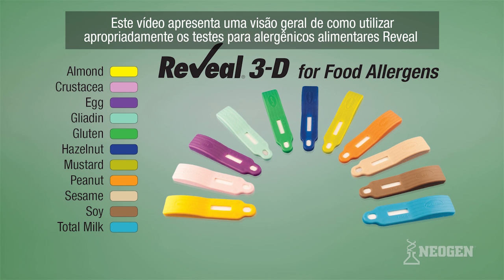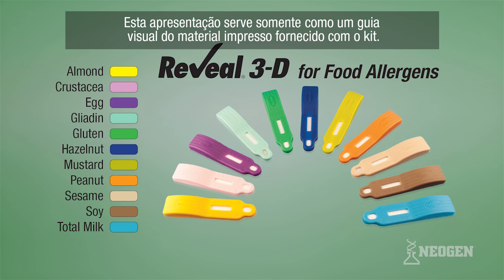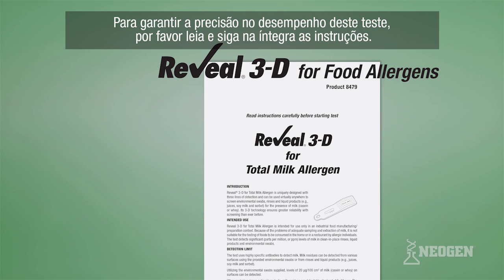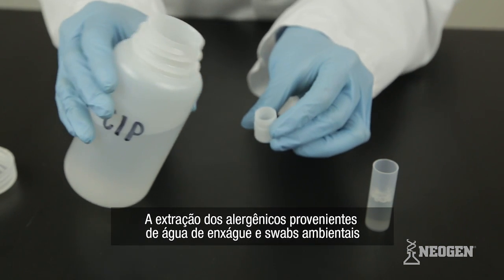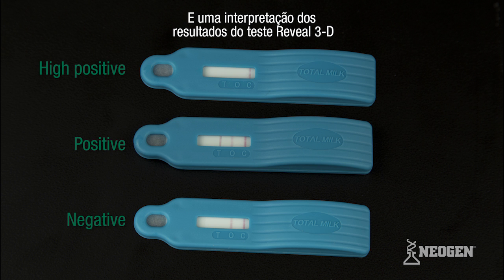This video provides an overview of the proper use of Neogen's Reveal 3D food allergen test kits by demonstrating the Reveal 3D total milk allergen test kit. Test procedures and materials for other Reveal 3D allergen tests may vary somewhat. This presentation serves only as a visual guide to the written materials supplied with the test kit. Please read and follow the test's written instructions in their entirety. This video covers the supplies needed to run a test, the extraction of allergens from rinse water samples and environmental swabs, a demonstration of the test procedure, and interpretation of test results.